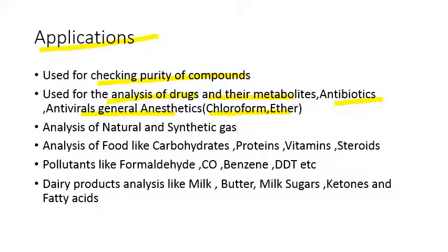Analysis of natural and synthetic gases, because it is gas chromatography, so the constituents present in natural gas mixtures and synthetic gas can be easily analyzed. Food like carbohydrates, proteins, vitamins, steroids can be analyzed.